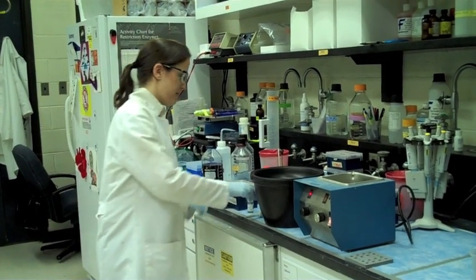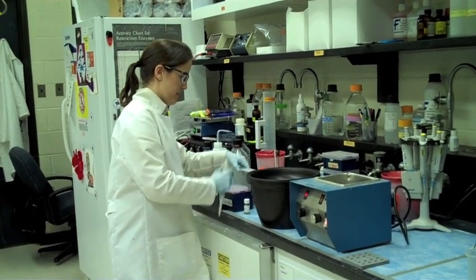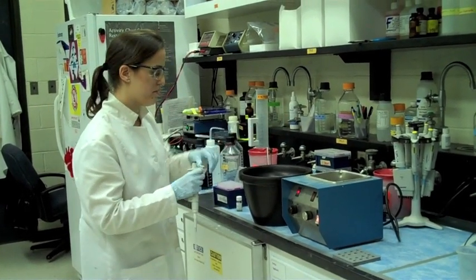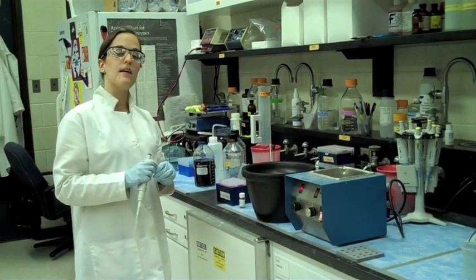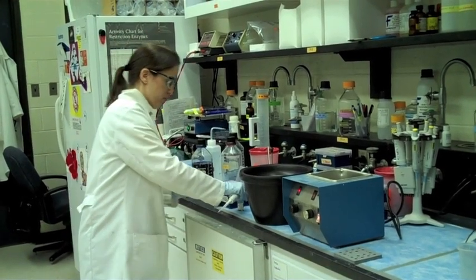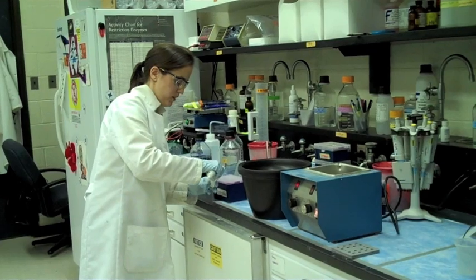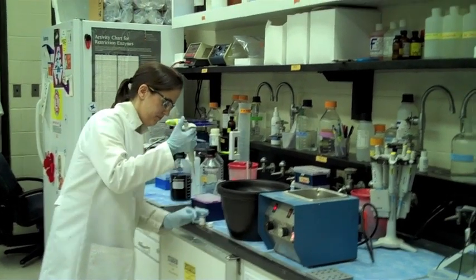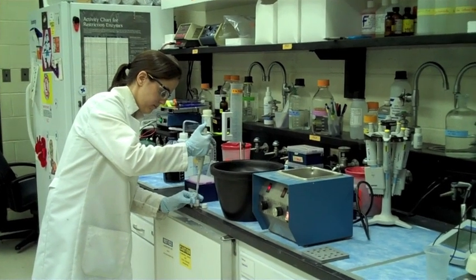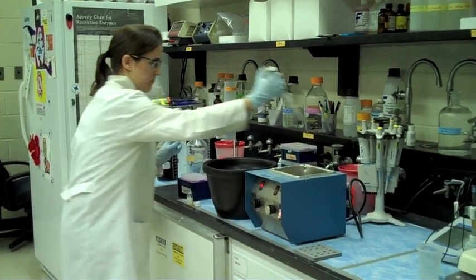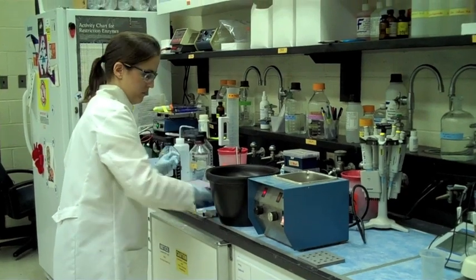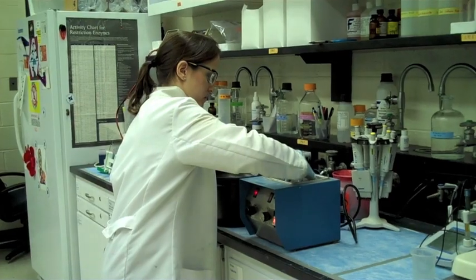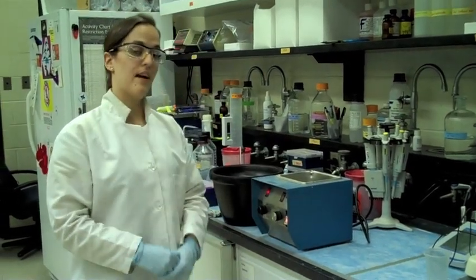Our cells have been chilling on ice for a couple minutes now. The next step is to put our cells at 37 degrees C for an hour to grow. They need food to grow, and our growth media is right here. We're going to add it into our cell DNA mixture. And now we have an hour to wait.